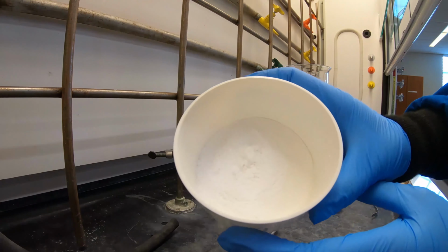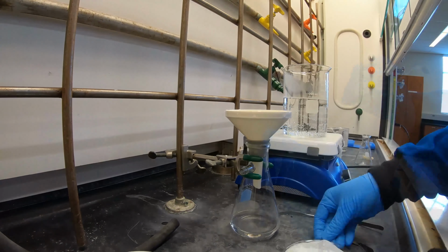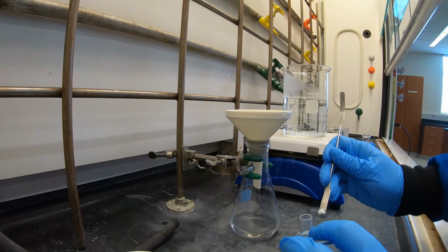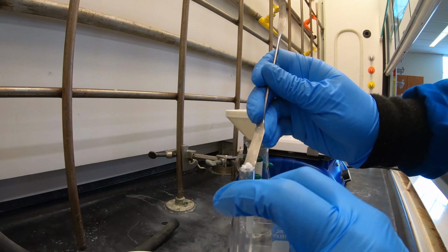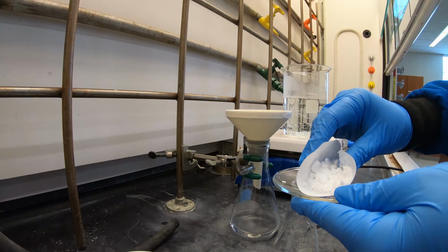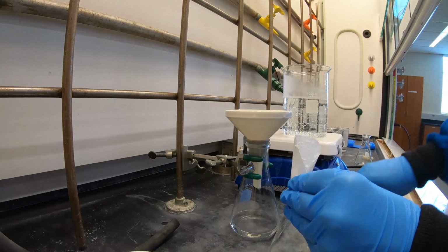Do not use a ton of water. Weigh the filtered solid to obtain the crude product yield. Now you're going to set aside a small amount of your crude product into one of your small test tubes for TLC analysis. Be sure to label the test tube as crude. Now transfer the rest of your crude product into a clean Erlenmeyer flask for recrystallization.